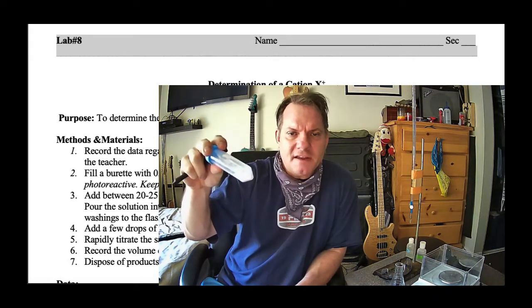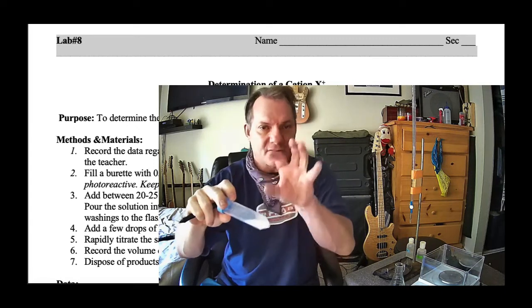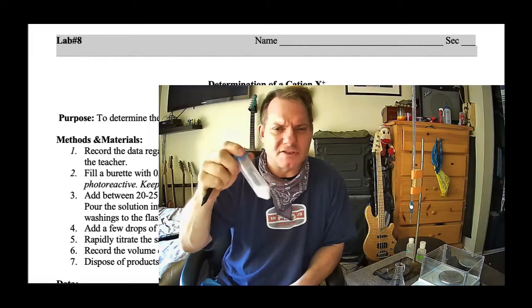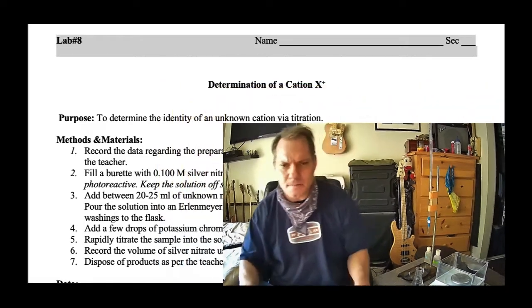So I have here an ionic compound, and I know that it's a monochloride, meaning that there's one cation attached to a single chloride ion. Thus the cation has to have a +1 charge. What I've got to do is figure out which cation this is. So let's take a look at some options.